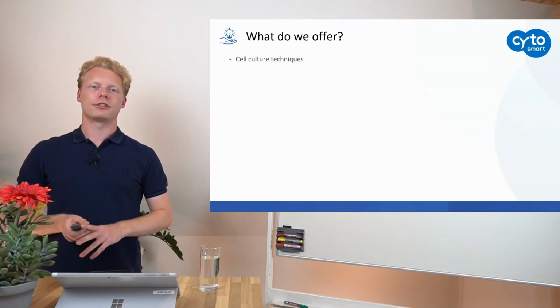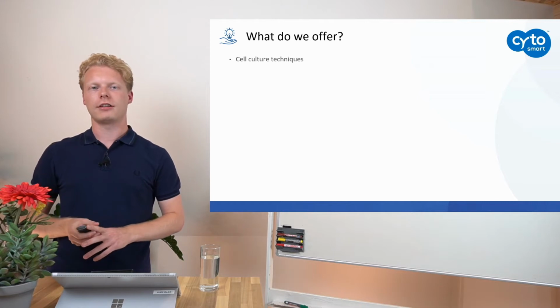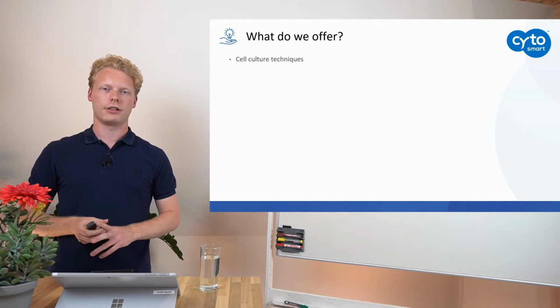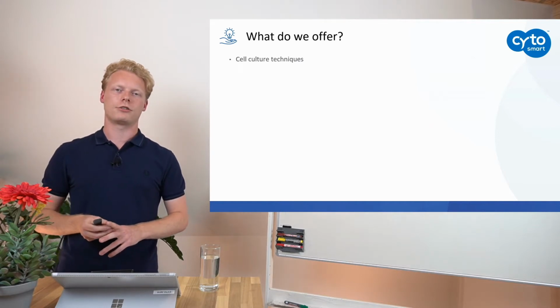However, before students can start generating their own data and perform experiments, they have to learn proper cell culture techniques. And this is also something where the Lux2 can contribute.